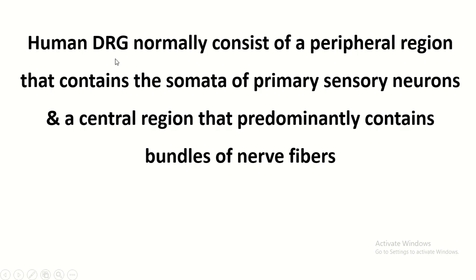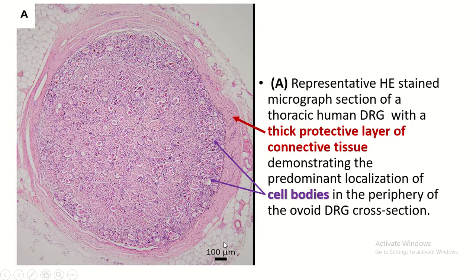Human dorsal root ganglia normally consists of a peripheral region that contains the somata of the primary sensory neurons, and a central region that permanently contains the bundle of nerve fibers. This is the cross-section of the dorsal root ganglia. You can see the thick connective tissue coat, the peripheral portions, and the central portion. The peripheral portion contains nerve cell bodies of the sensory neurons and the central portion contains nerve bundles.